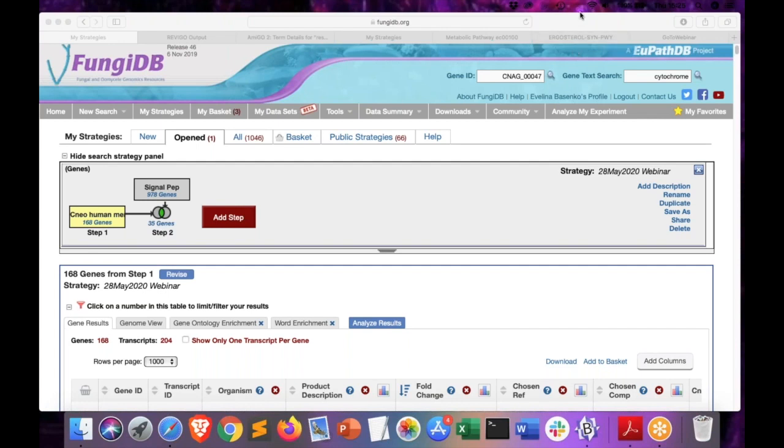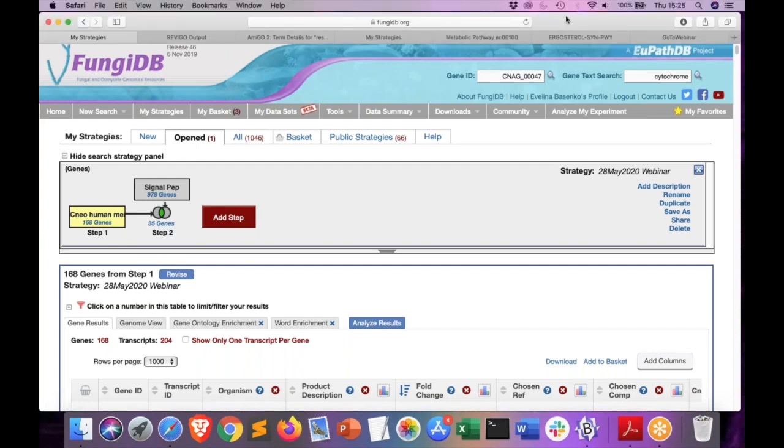All right, thank you, Amar. I am on the FungiDB website, and I'll show you a few searches that you can do within this website. And similarly, they work on essentially all other VEuPathDB sites as well.